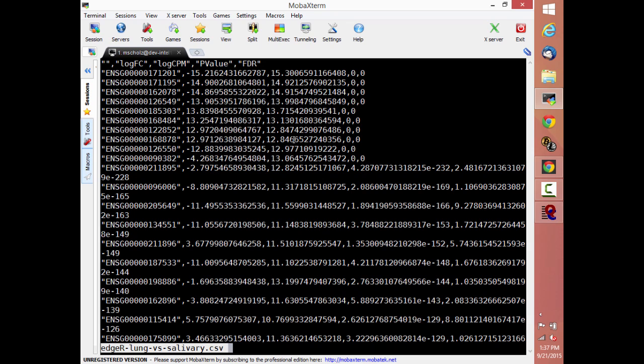Beyond the fact that there were what looked to be hundreds of different genes that showed up as differentially expressed in your samples, you can see that there are 1, 2, 3, 4, 5, 6, 7, 8, 9, 10 genes with an FDR of 0, which is pretty good, indicating that at least given the reads that you gave it, it is 100% certain that these are different from each other.